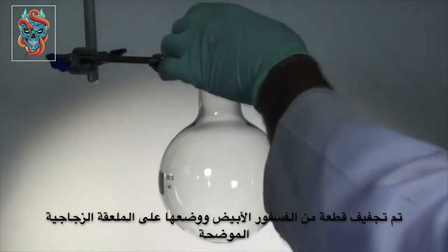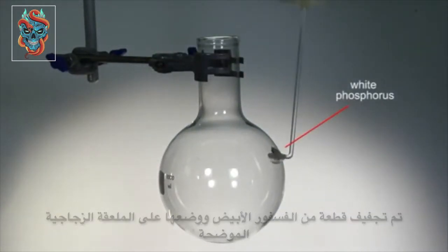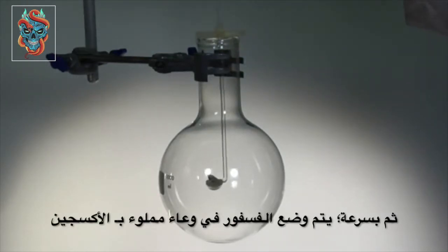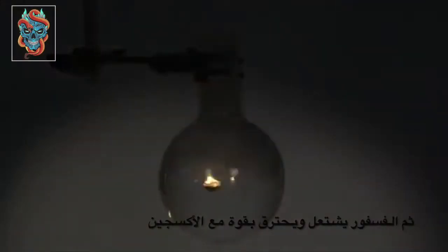A piece of white phosphorus is dried and placed in the glass deflagrating spoon. The element is lowered quickly into a flask of oxygen. White phosphorus is stored underwater because it is spontaneously flammable in air. The element soon ignites.